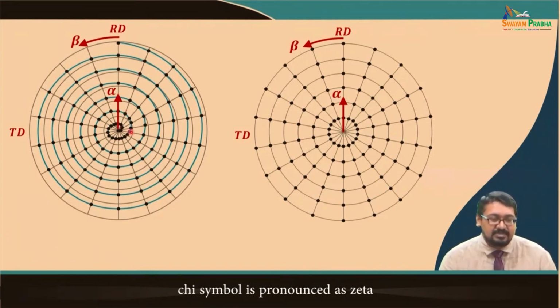This we have shown very roughly, and if we vary it like that, a spiral is obtained, and there are various points shown here. These points indicate that at every point the machine is stopped for a certain moment for radiation. So it is radiated and the diffraction from that particular HKL plane is obtained, and then alpha beta is changed, and in this way it is scanned throughout the whole pole figure from 0 to 90 degrees.